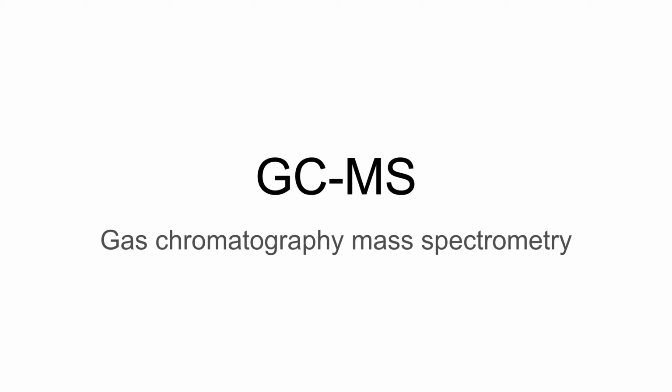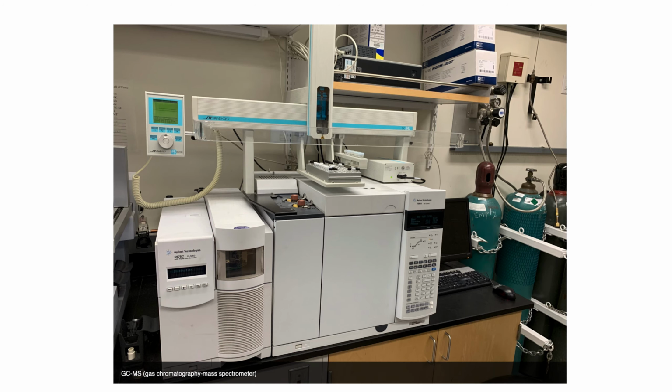Everyone, today we're presenting on gas chromatography-mass spectrometry, also known as GCMS. As the name implies, the first part is gas chromatography, and you can see the entire machine here. However, before the sample can be injected into the port of the machine, it must be prepared.